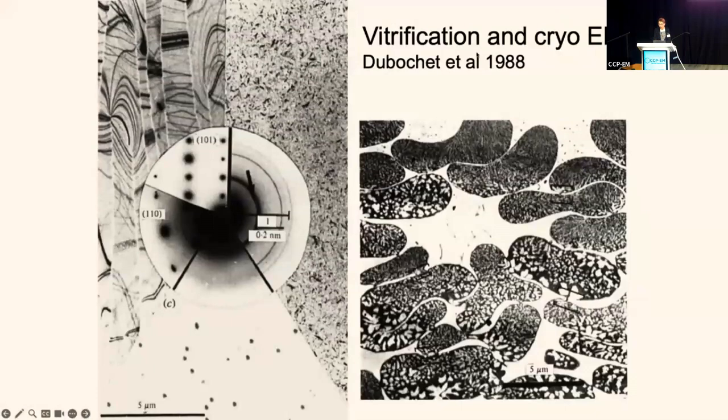And then if you have a high pressure freezer, you can get deeper, which is why we need high pressure freezing to look at pieces of tissue and thicker stuff. So the ingredients were all there at that point. We're still in the 1980s, and this was the beginning of the idea of cryo-EM.